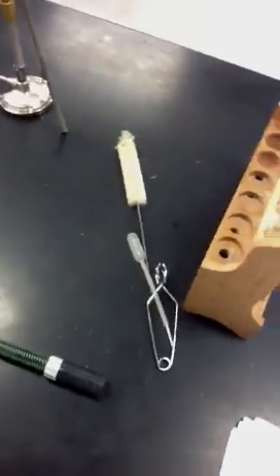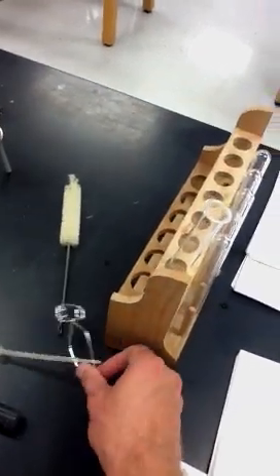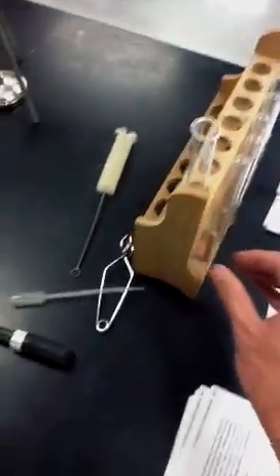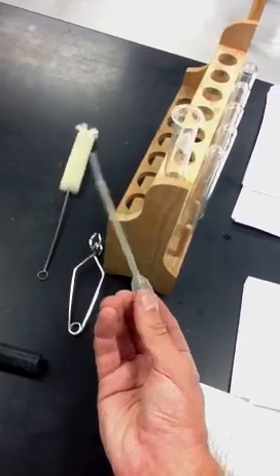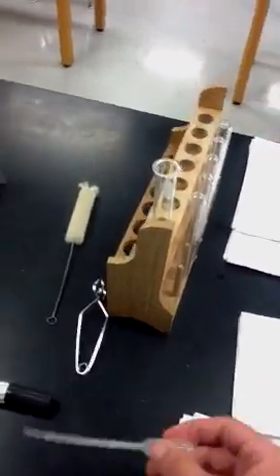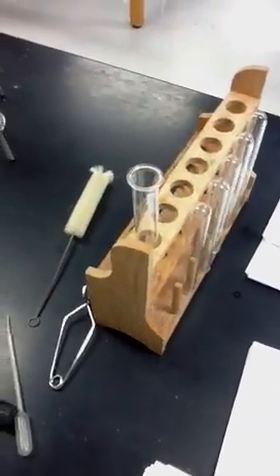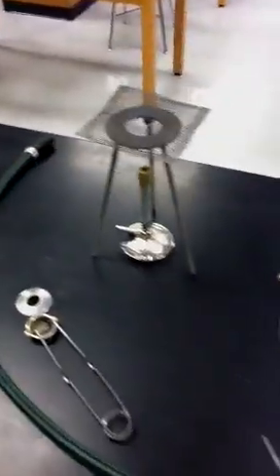Let's recap the test tube things: we have the test tube, the test tube rack, the test tube holder, and the test tube brush — notice all the things have the name test tube in them. And then finally, this thing here is called a pipette. It's used to drop liquids in and get liquids out of things without having to put it in your hand, so it's a safety issue as well. I would go over these items before you take the quiz. Remember, you're going to have to know all of these things and what they do for the competition. Good luck.